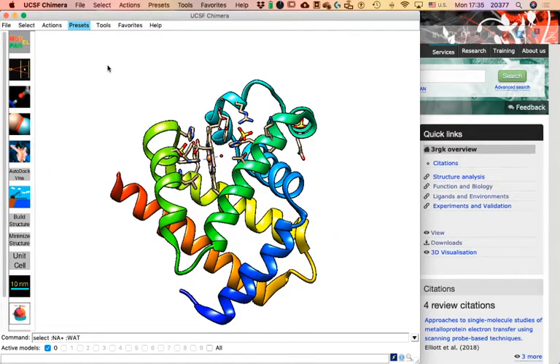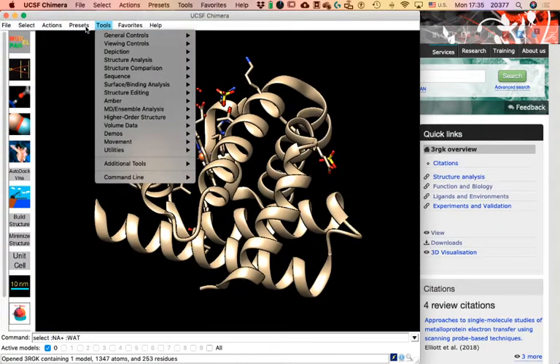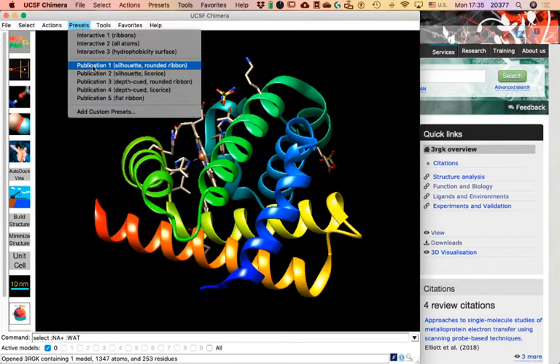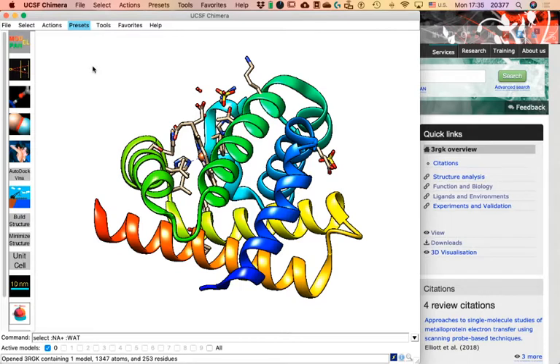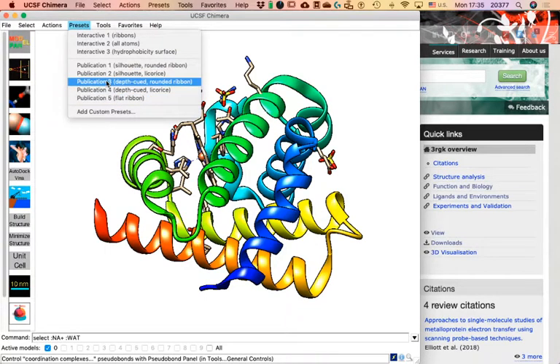As I said, I'll close my file, open it again, and do exactly that: Presets > Interactive Ribbons, then Presets > Publication 1. These presets are actions and selections you could perform on your own, but in Presets they are automated so you can access them quickly. You can also add your own presets — you just have to know what you want and program it.